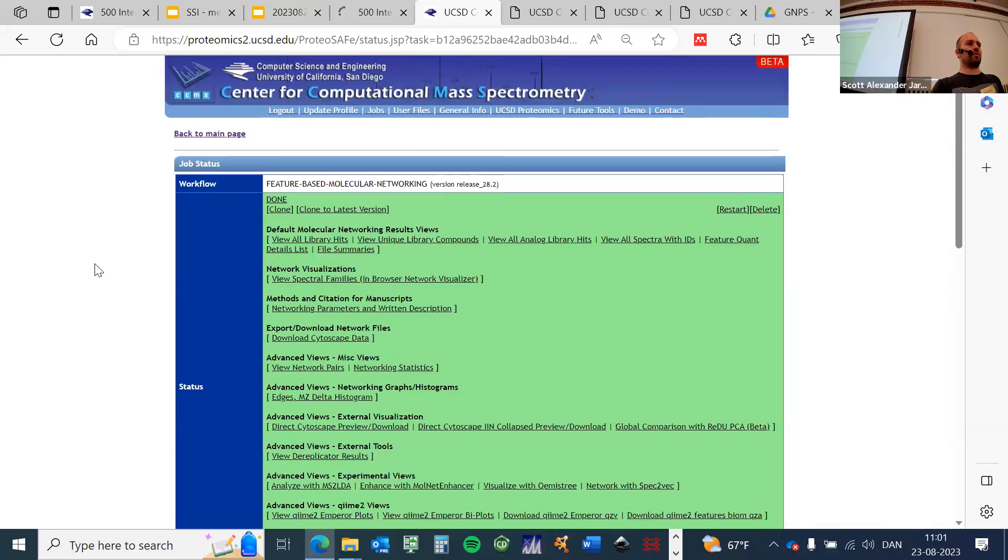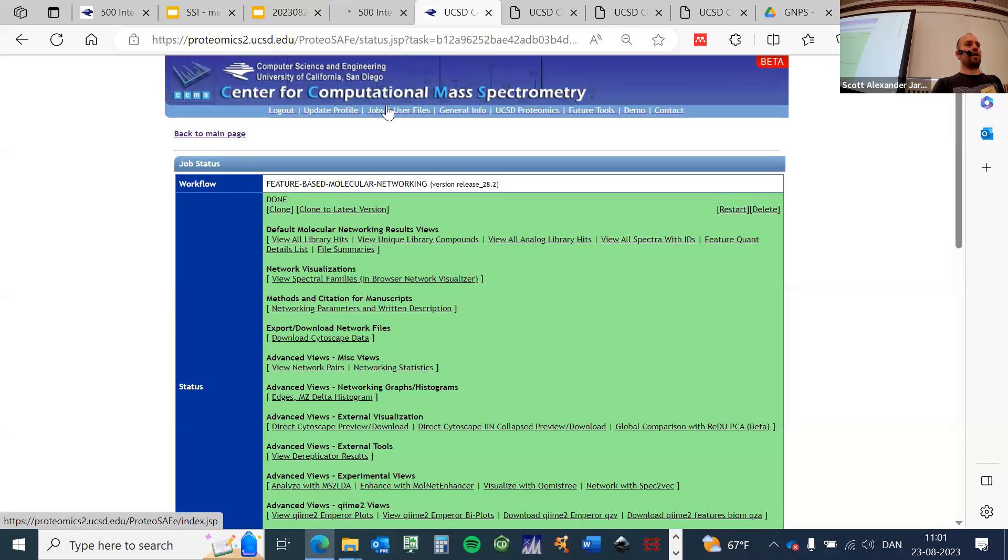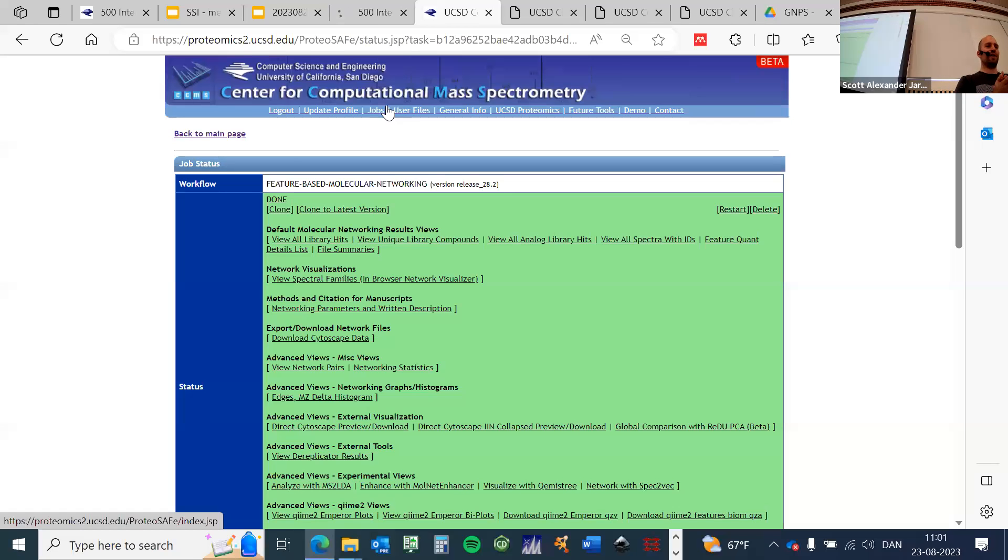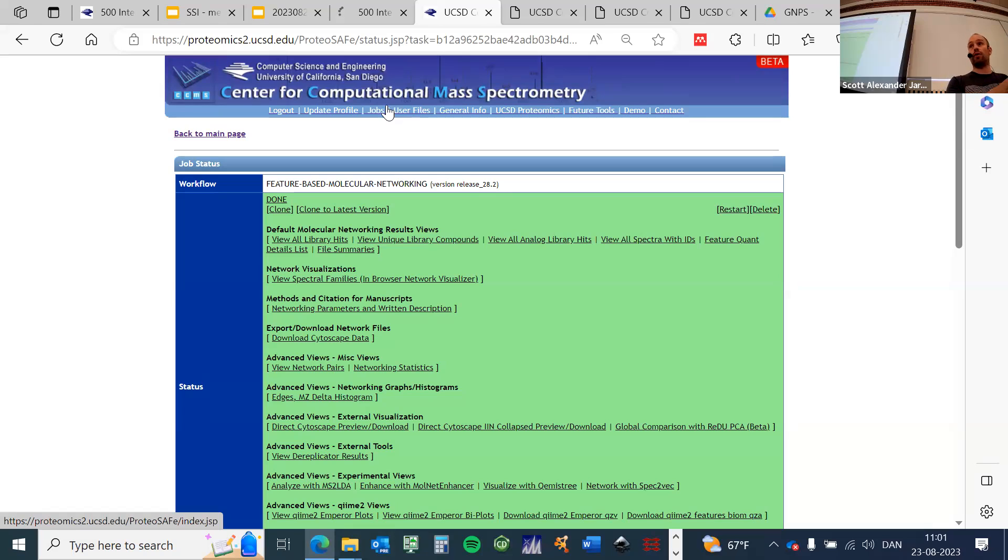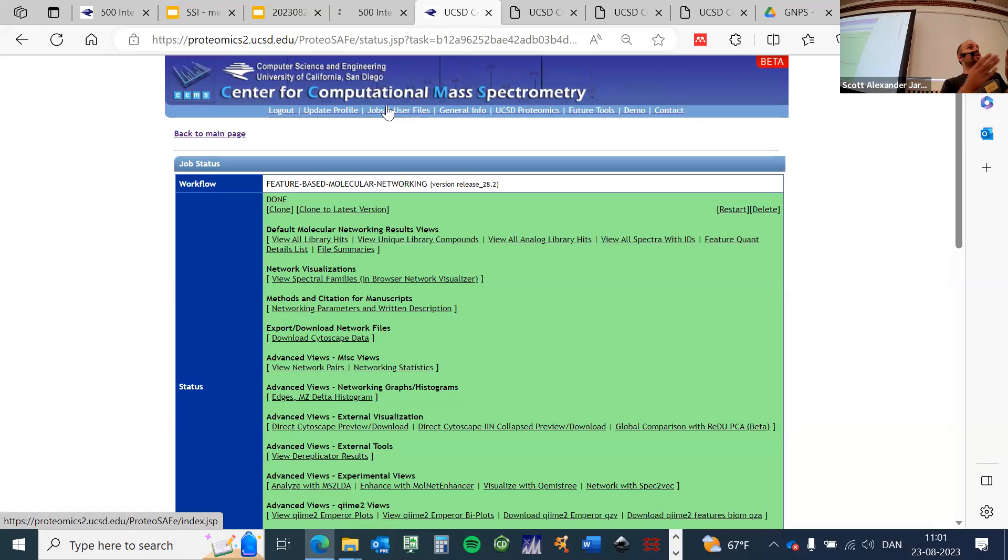This is the main page of your job results and there's a lot of information in here, so don't get overwhelmed. I just want to show you briefly what I typically look at first and what I think are the most important views, and then also show you how to download the data. Of course, we want to know what did we identify.